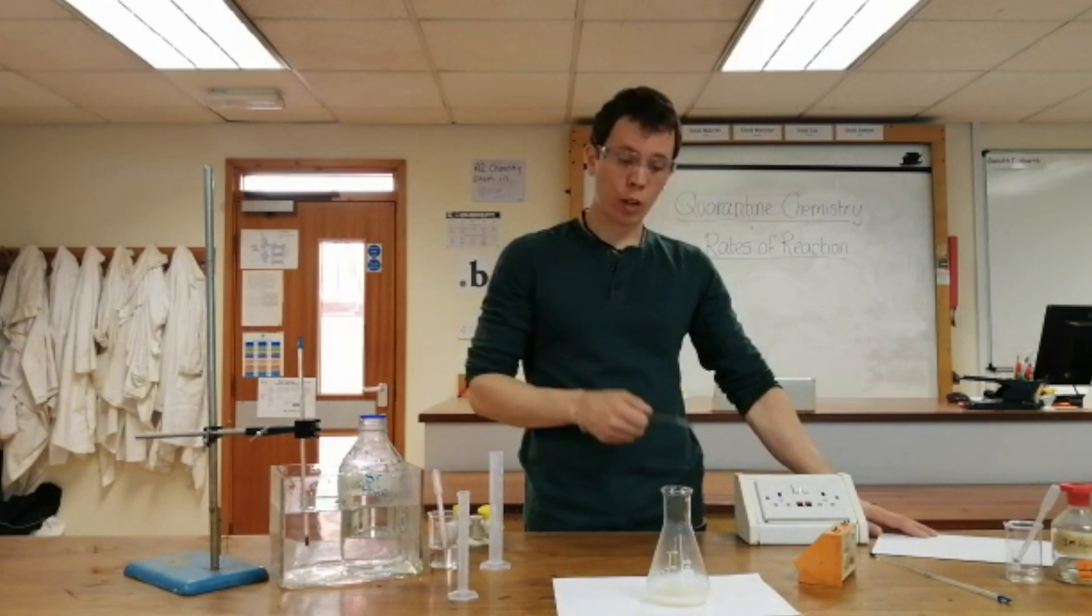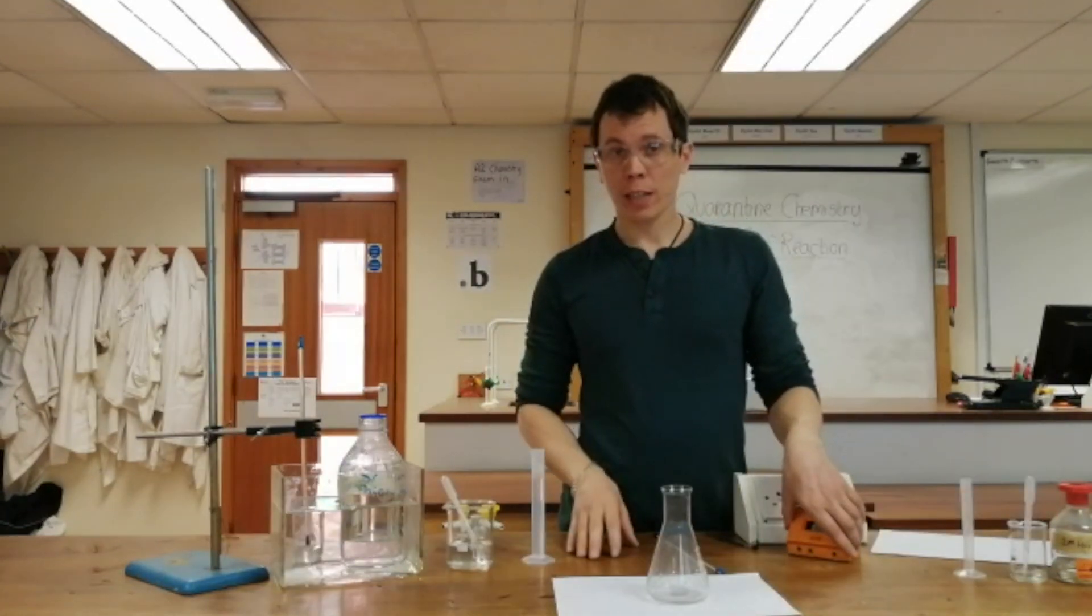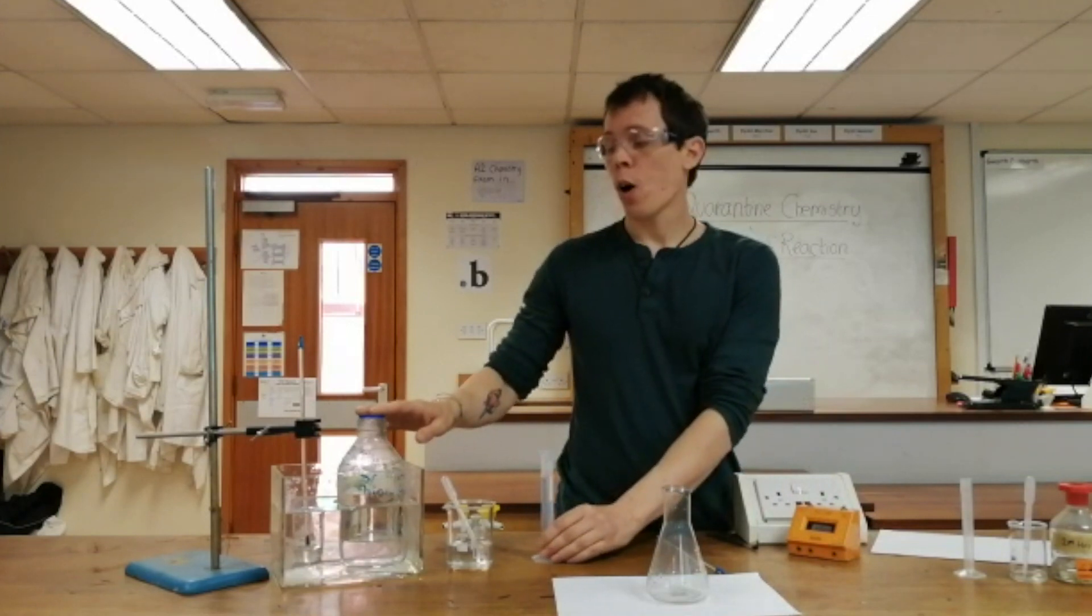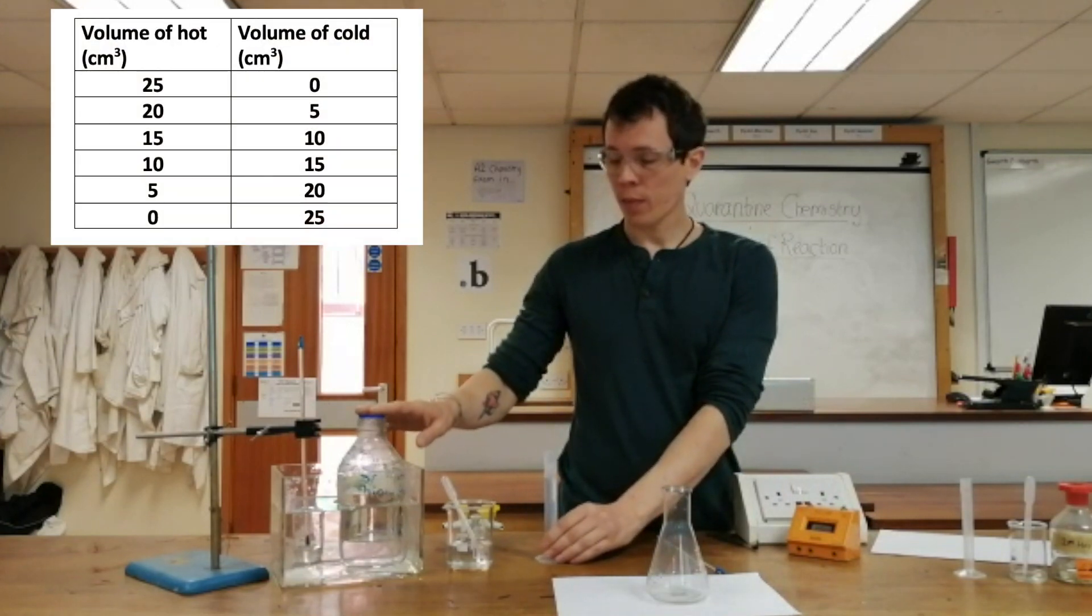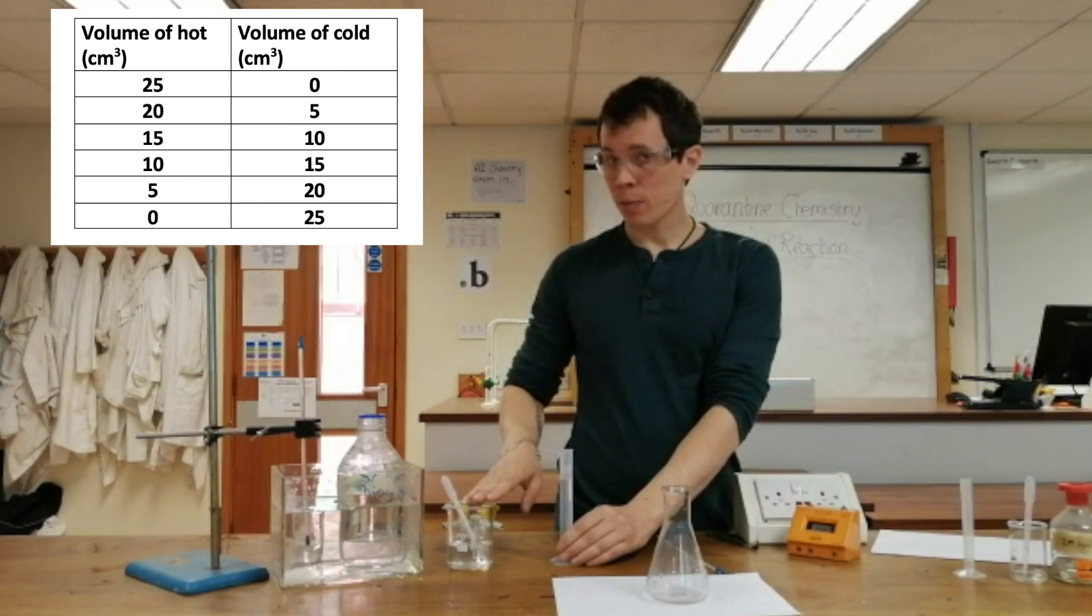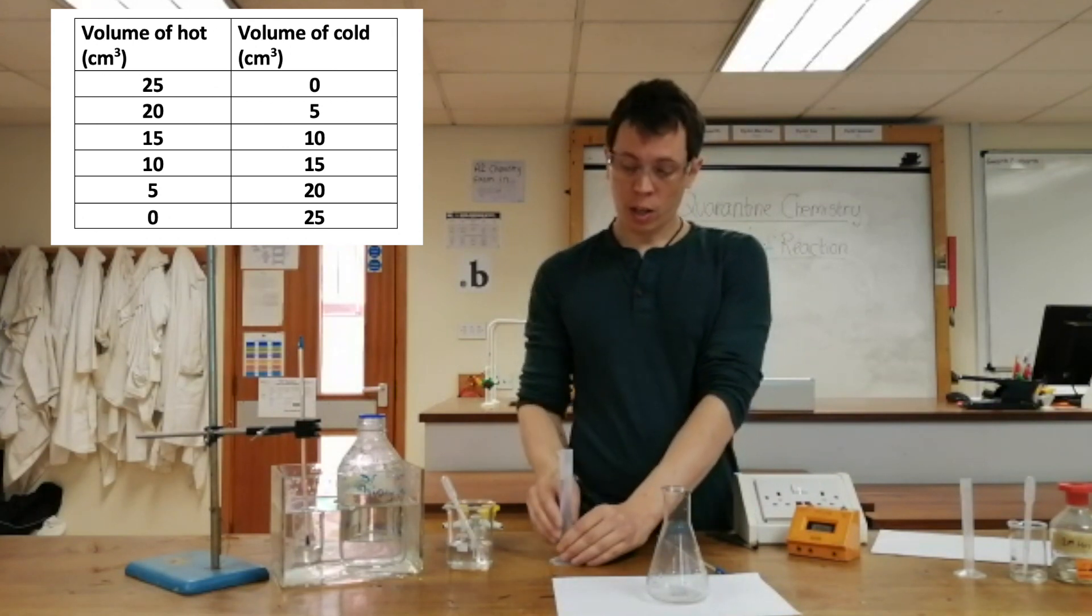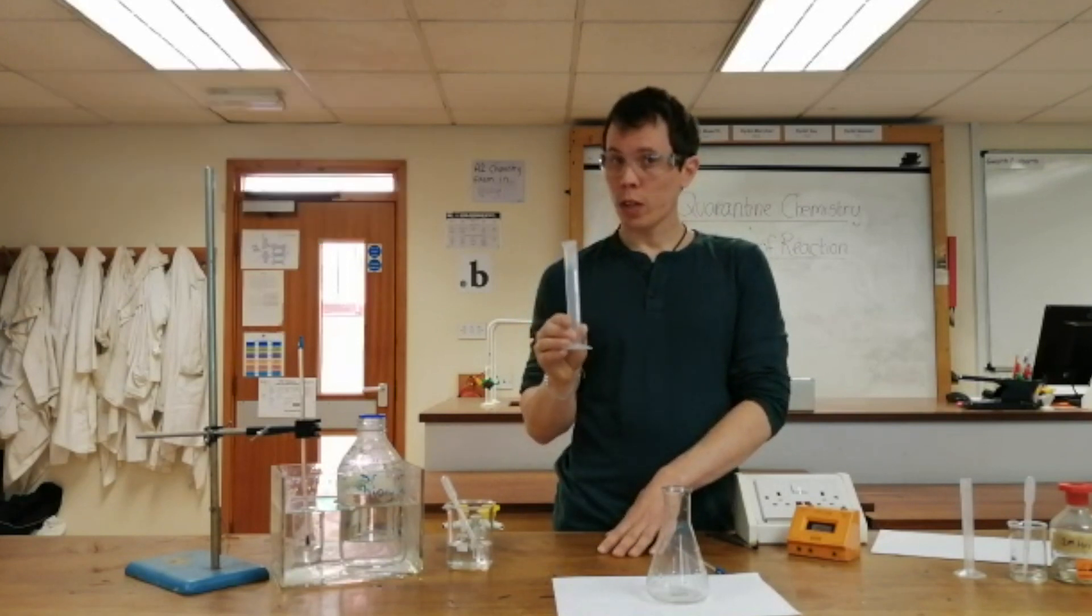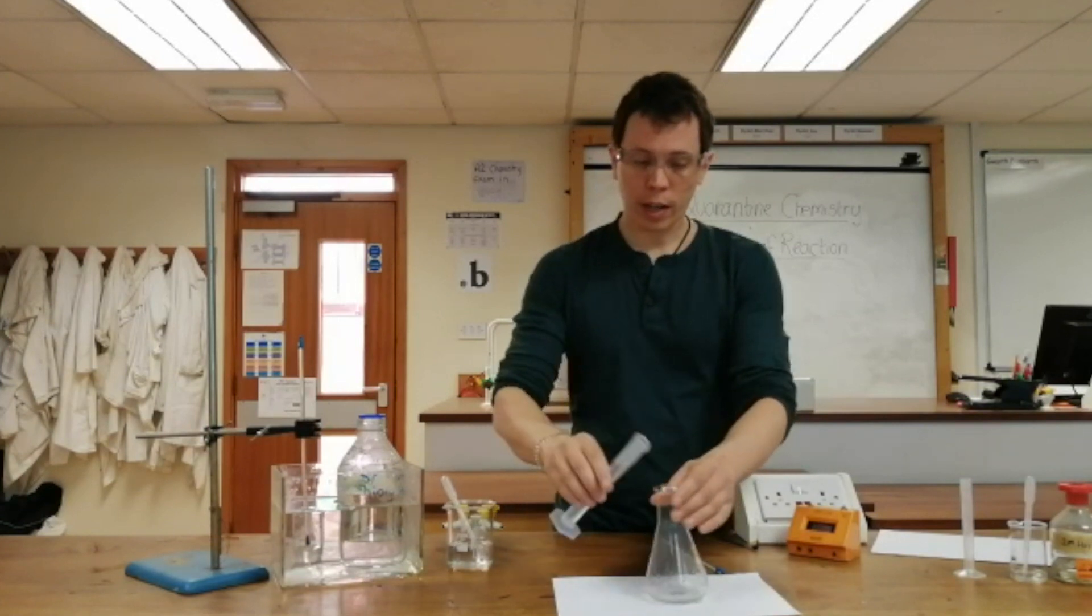I'm going to repeat the experiment, but this time I've measured out 20 centimeters cubed of the hot sodium thiosulfate and I've measured out 5 centimeters cubed of cold sodium thiosulfate from the fridge. So I've still got a total of 25 centimeters cubed, but this time it's going to be cooler than before. So I'll pour that in.